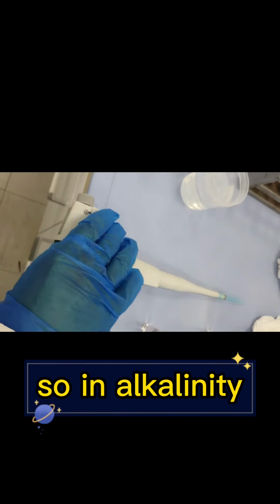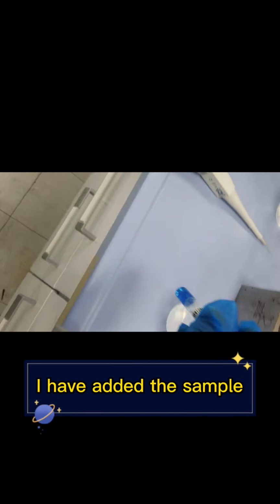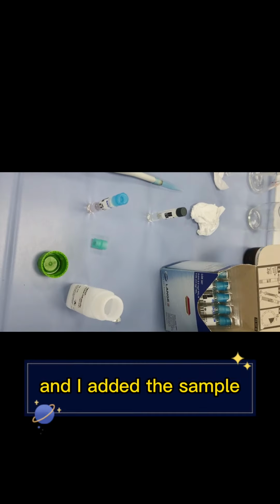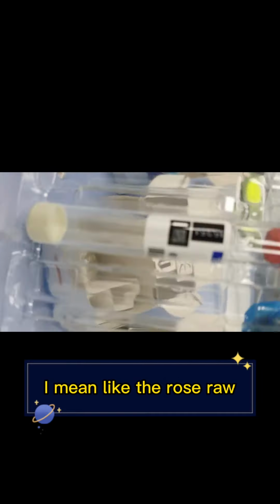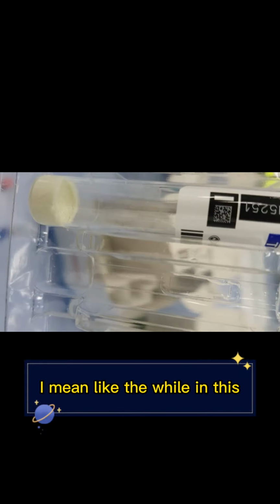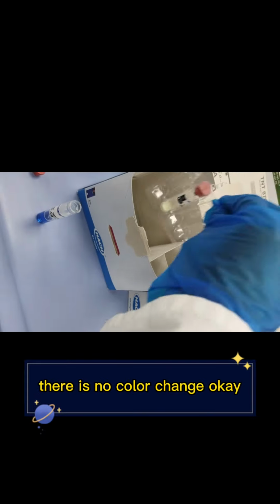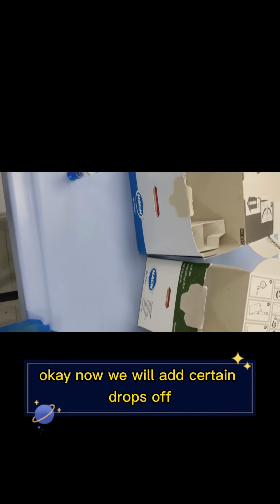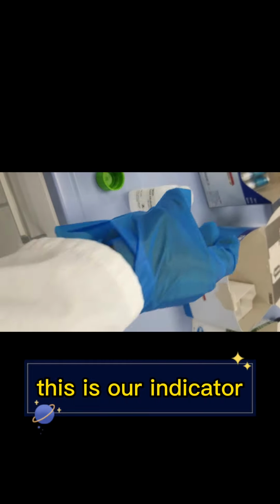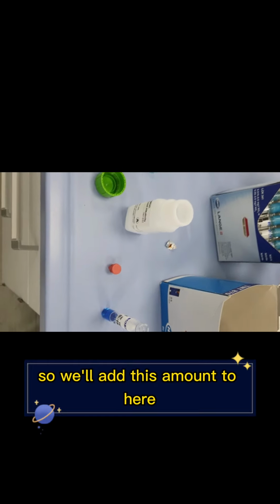So in alkalinity, I have added the sample, so you can see that when I added the sample, the color changed. And if you see the vial in this, there is no color change. So they are already prepared reagents inside the kits. Now we will add certain drops of this, our indicator, so we'll add this amount here.